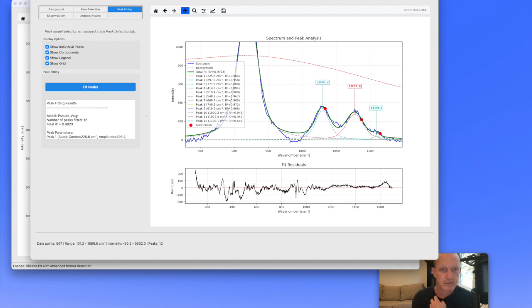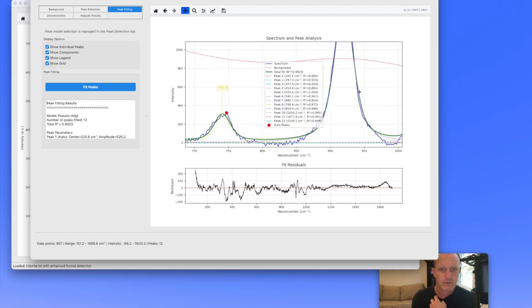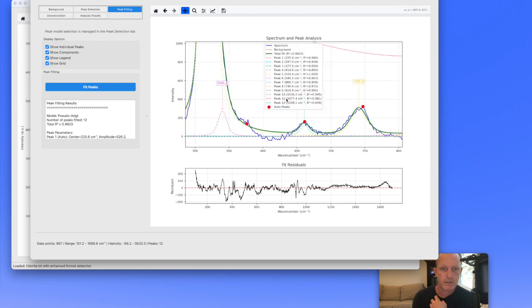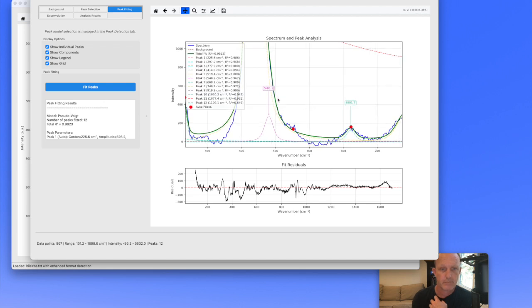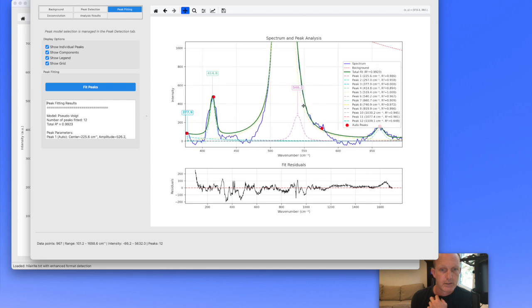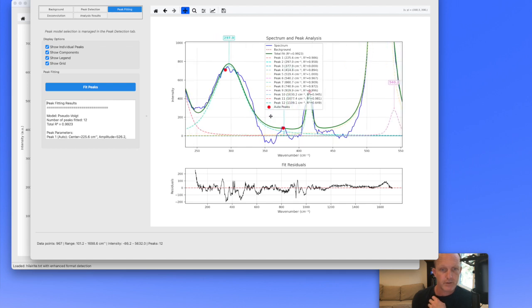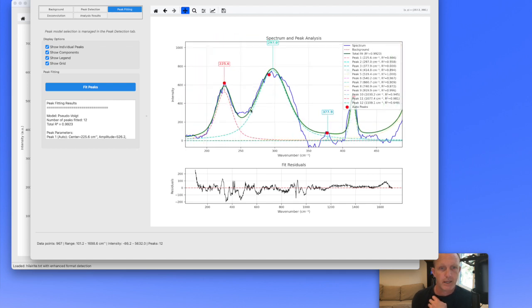Let's take a look at some of the other stuff. Yeah, maybe I could do better on the background fitting. This one's 540. It didn't like that shoulder that much. Might add some helper peaks to try and fit that, but maybe I can delete it. Oh, I see why this deleted, because it's too low, maybe, and it didn't really fit the baseline. And this is terrible. There's definitely another peak I need to add there.